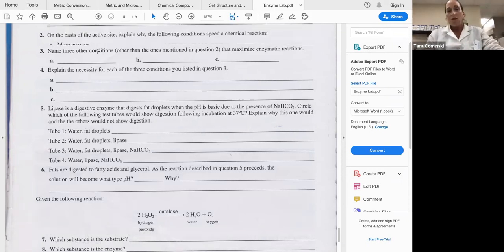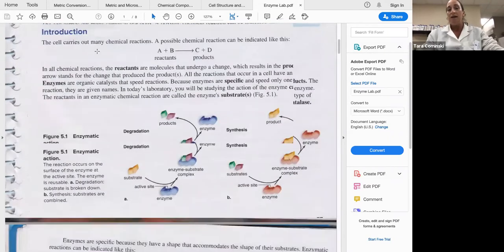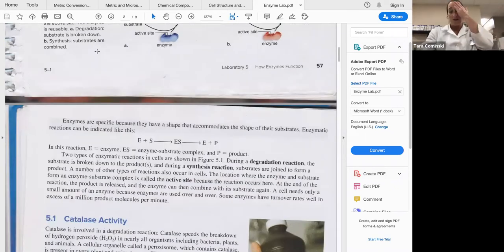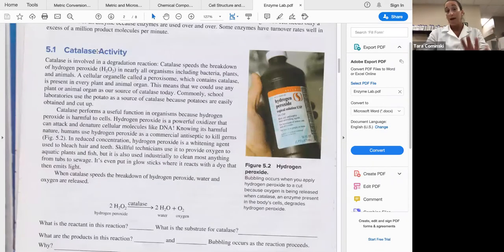All right, so let's just go back really quickly, just a little bit of background information. Again, background information is all, sorry, my thing is boiling away there. Anything that I'm going to talk to you about is written in here in the background information of the lab, okay?